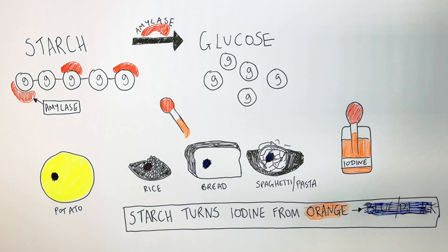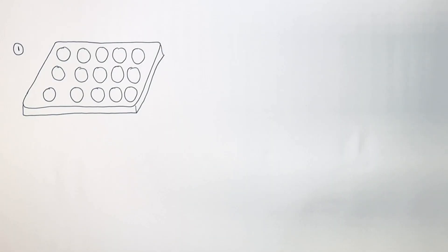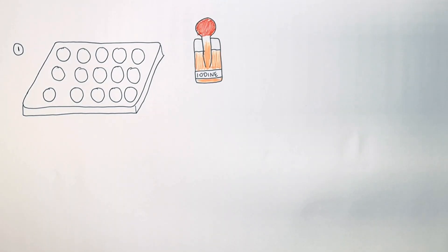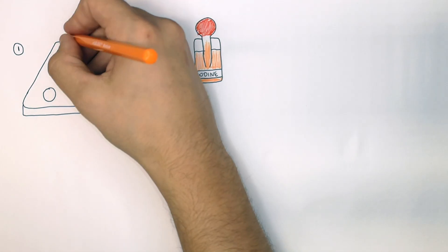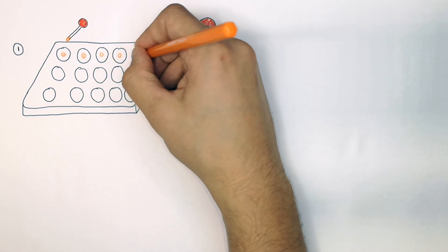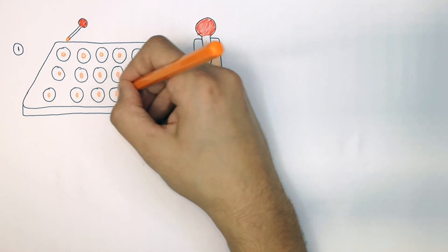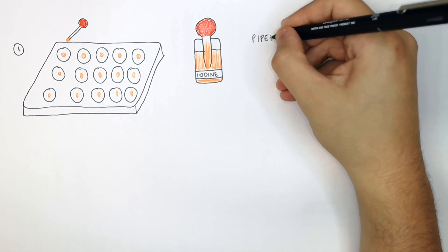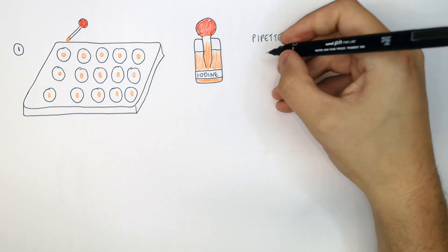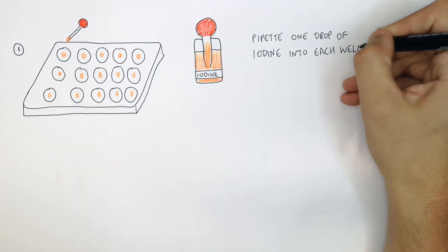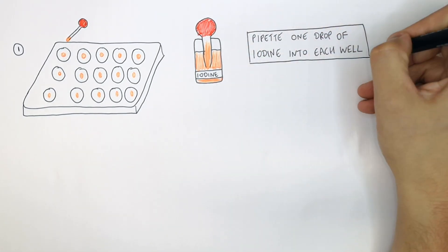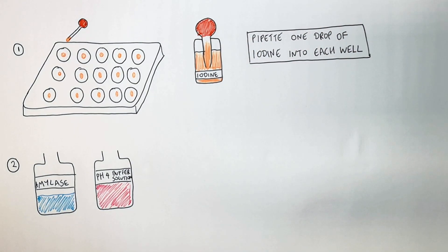You get your well plates and your iodine, then drop one drop of iodine into each of the wells. You must drop only one drop in each well — this is a control variable. Pipette one drop of iodine into each well.